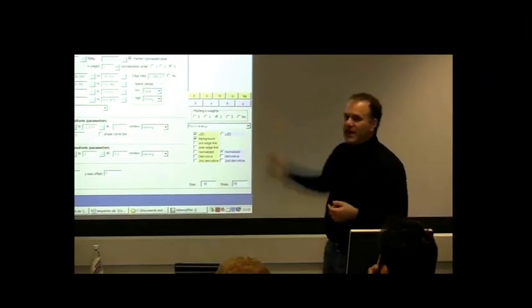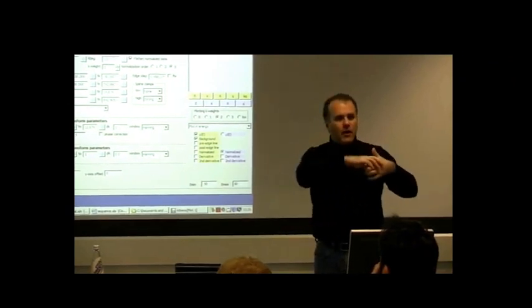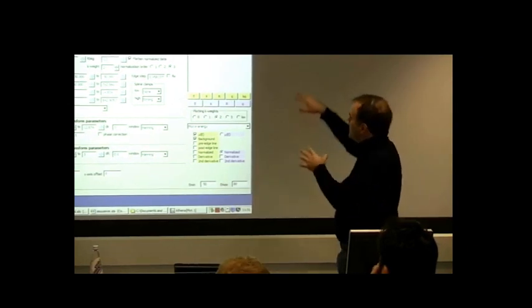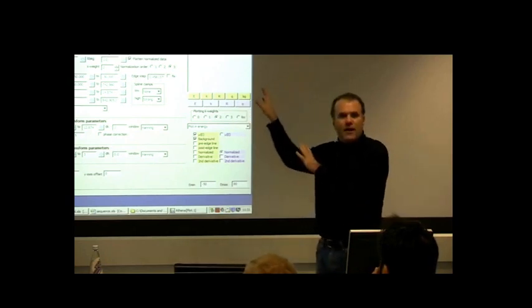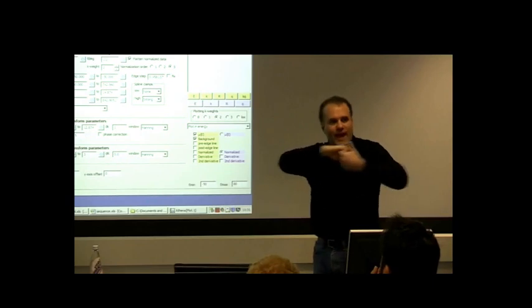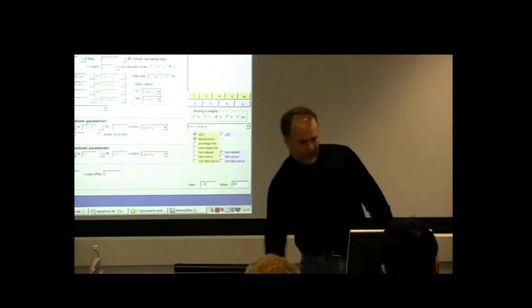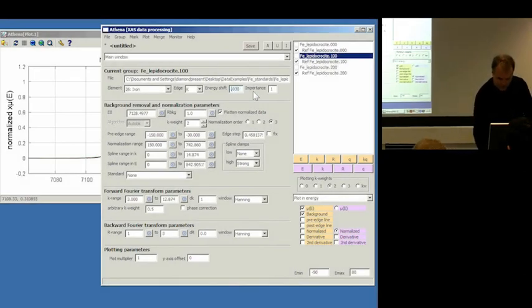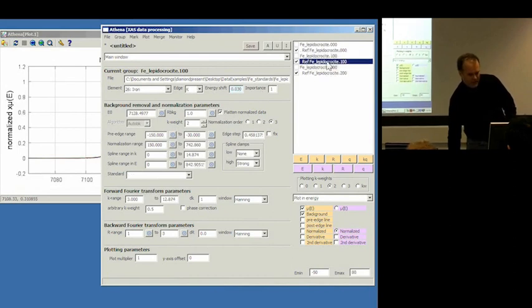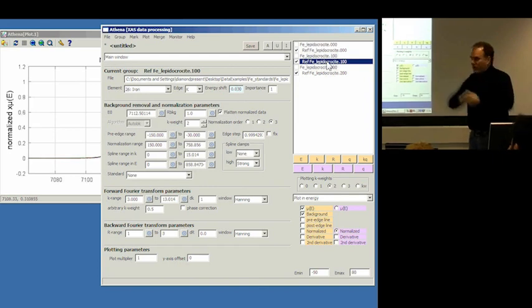When you change the energy shift to do an alignment for one, it drags the other one along. Right? So that's why we can line up the reference foils and have the data be properly lined up. So the one drags the other one along. That is what's being indicated by that blue color that we can't see up on the screen, and that's what it means for a sample to have a reference. Okay, so that wasn't supposed to be 1.0, it was supposed to be 0.03. So I'll change it back, and of course that one is also 0.03 because they're tied together. If you move one, the other one moves.